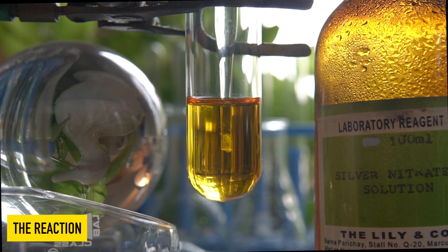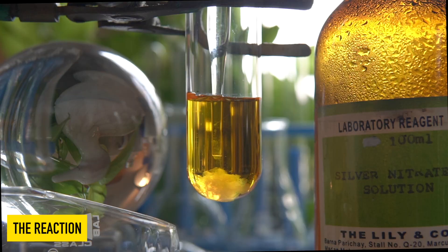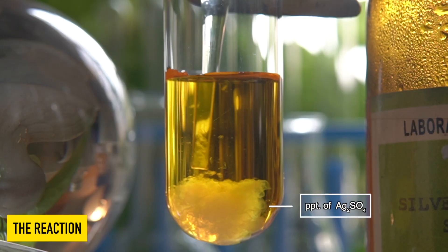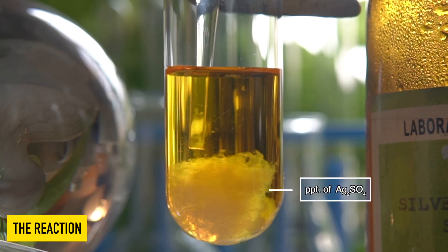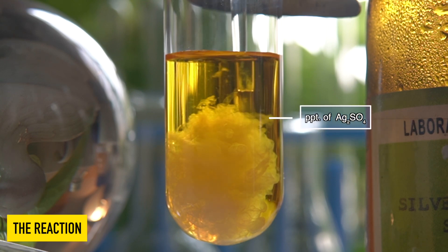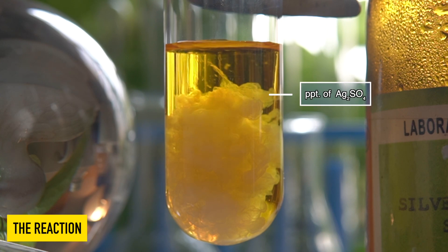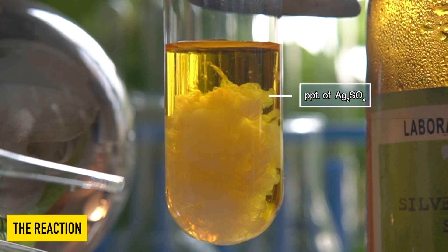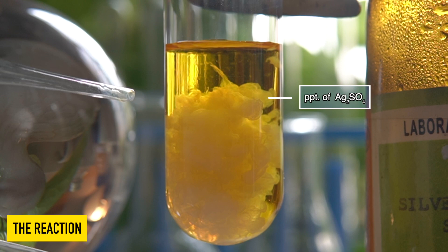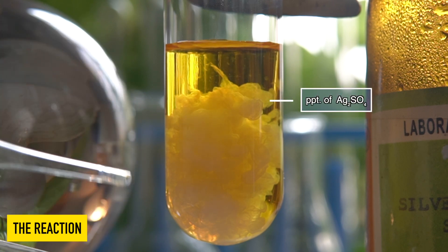Now we will add colourless silver nitrate solution into the FeSO4 solution slowly and observe the effects. The insoluble white precipitate that has been formed at the bottom of the test tube is nothing but silver sulfate.